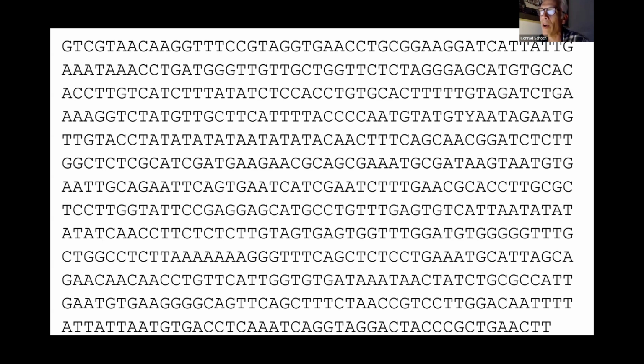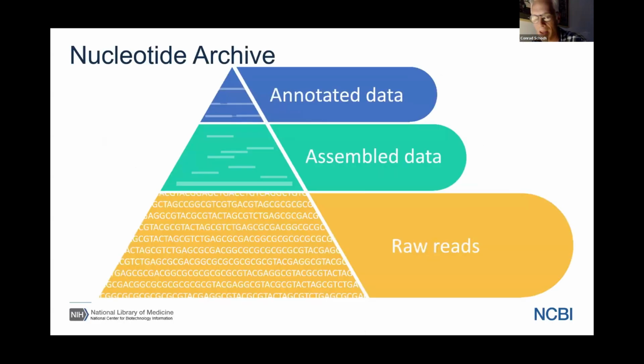How do you know which organism it came from? How do you know where it was collected from? And how do you know if you can collect it again? So let's see if we can use some of the tools at GenBank and other archives at the NCBI to answer some of these questions.